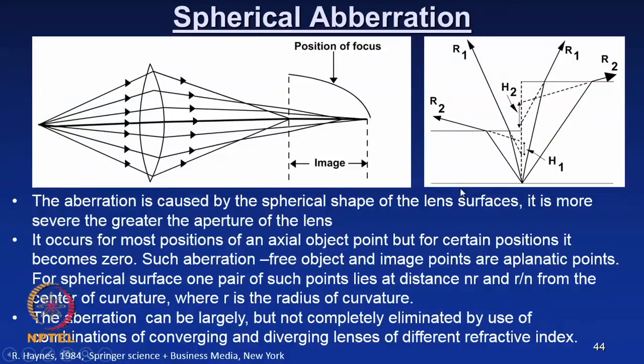The image shown on the right-hand side is what I wanted to bring to your attention: what happens to this spherical aberration when you view the specimen with the cover slip. Yesterday we saw the numerical aperture and the light grasping power of an objective lens, for a dry lens as well as an oil immersion lens, and for a bare sample as well as a sample with a cover slip.